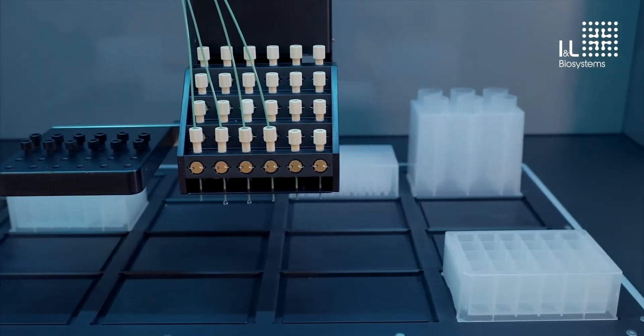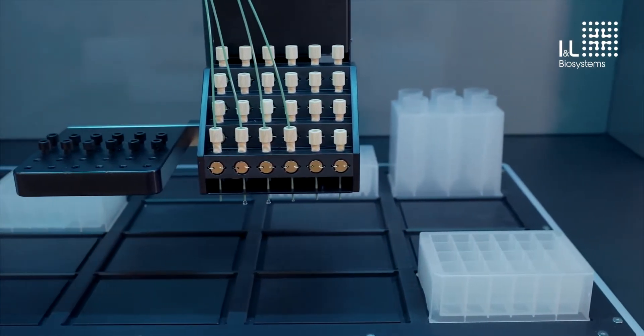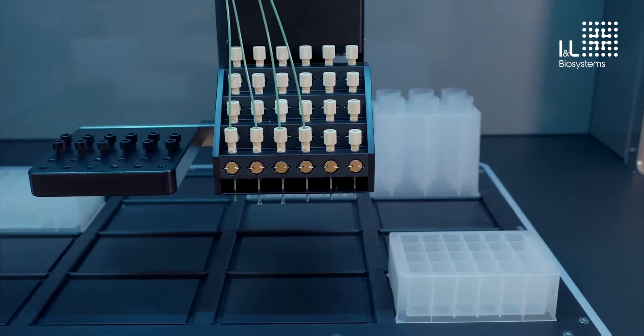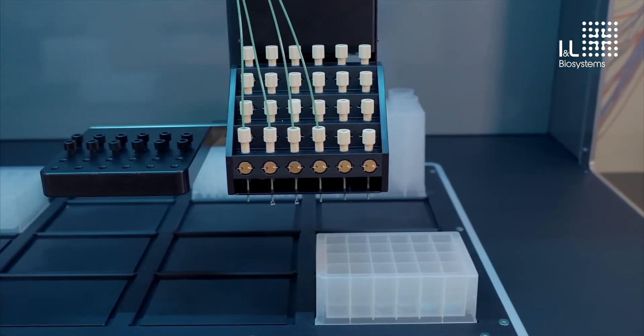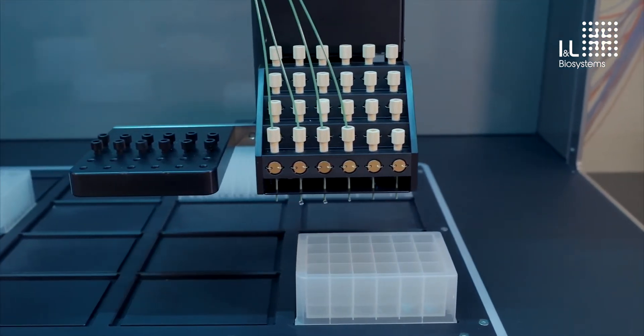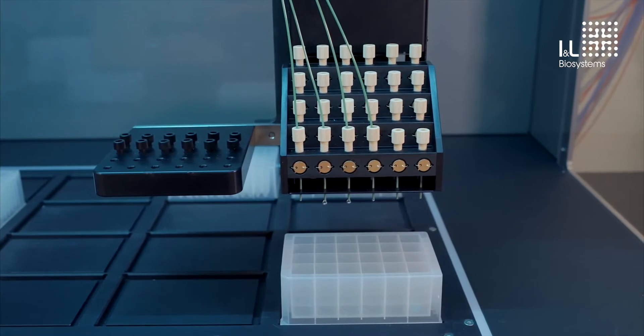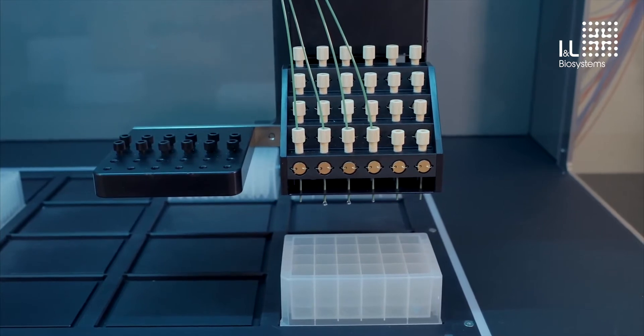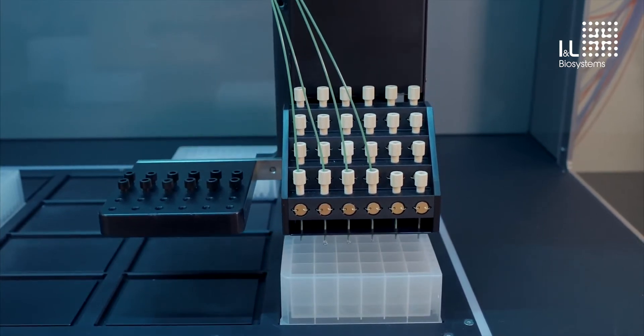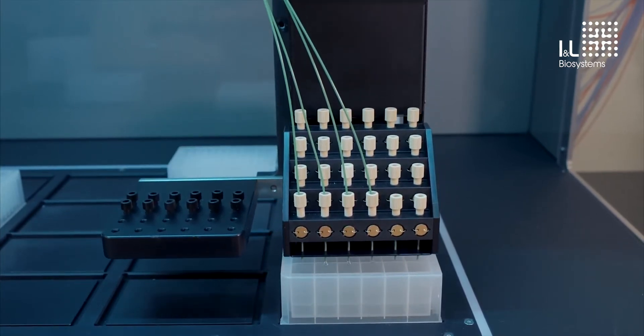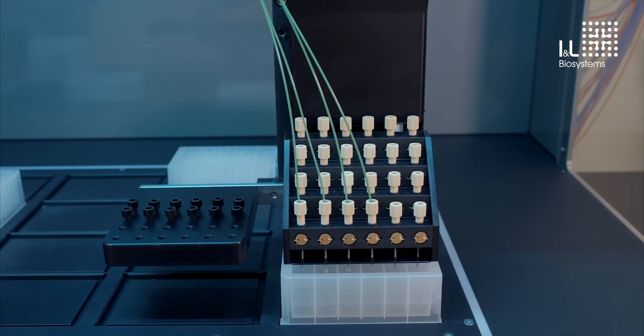There is an additional deck position dedicated for waste. As an option, you can get a chilled fraction collection deck to keep your samples at 4 degrees or any other desired temperature. Placing the entire Protein Maker inside a cold room is also an option.